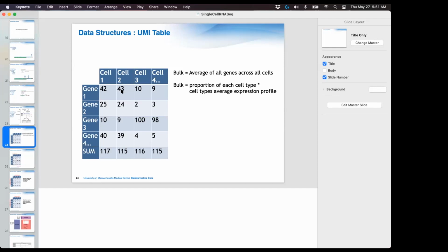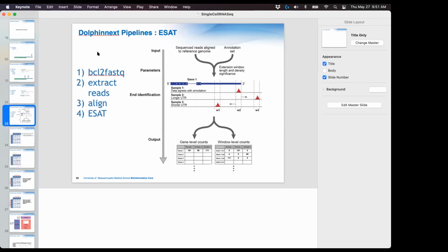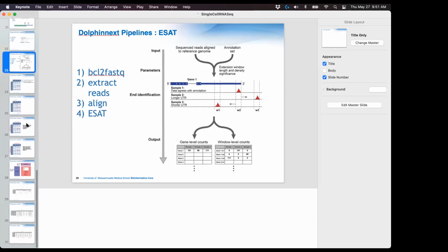Yeah, thank you. It also depends what step in this pipeline you're in. The FASTQ files are larger than the BAM files, which are larger than the final UMI tables, so the file size shrinks as you get further into the pipeline. But certainly some of them are 1 to 100 gigabytes, and that depends on the number of cells and how deeply you sequenced your sample. Thank you.